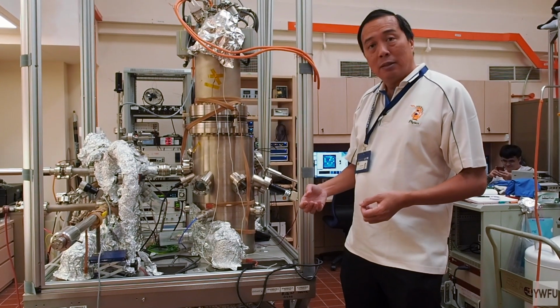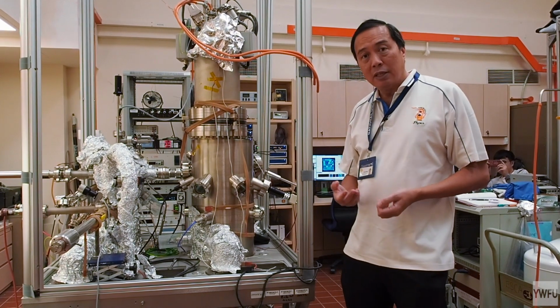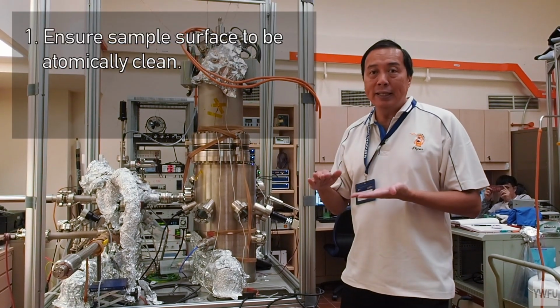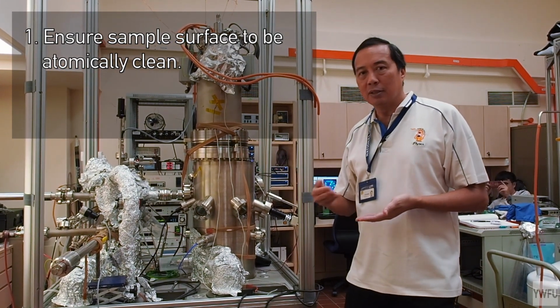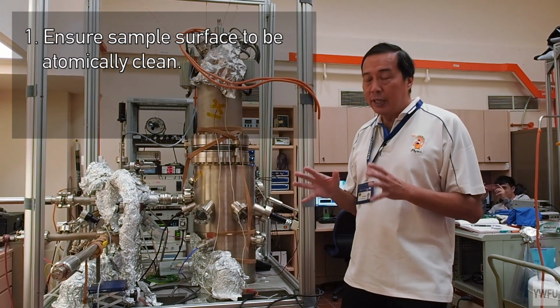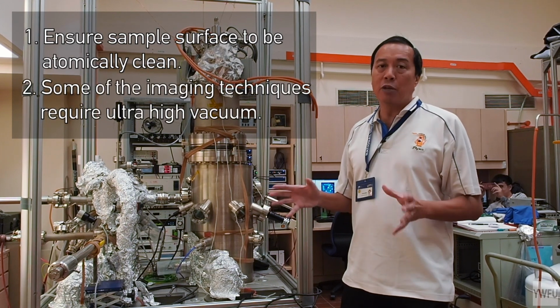Why do we need ultra-high vacuum? We need ultra-high vacuum for two reasons. The first reason is we want the surface to be atomically clean. We don't want any water or gas molecules like oxygen, nitrogen, carbon dioxide to stick on the surface. That's why it has to be very clean. Also, some of the techniques we use require a vacuum environment.